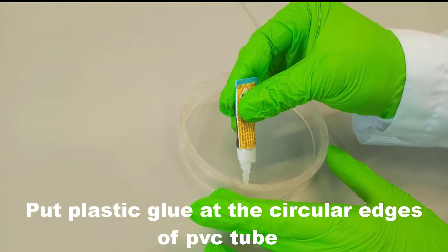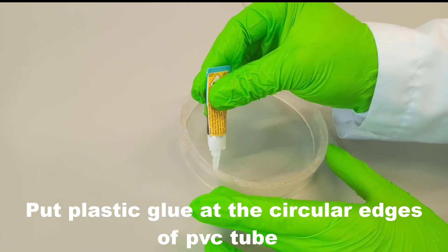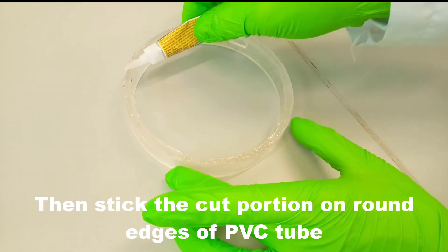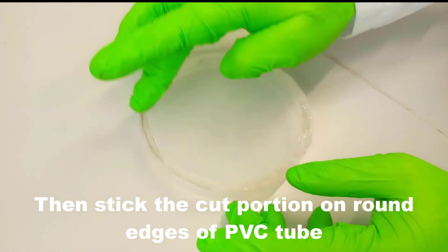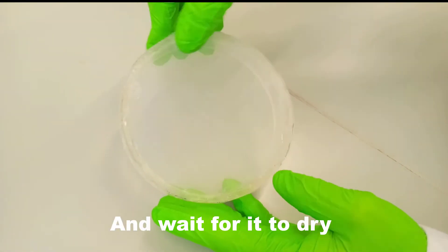Put plastic glue at the circular edges of the PVC tube. Then stick the cut mesh portion on the round edges of the PVC tube, and then wait for it to dry.